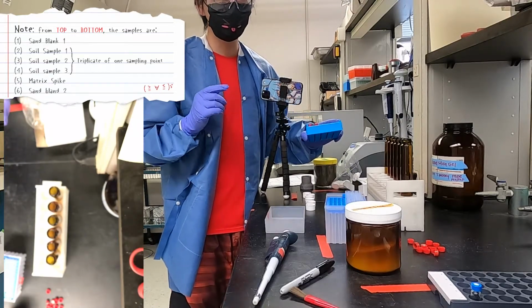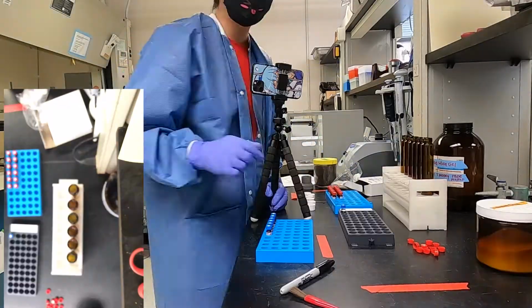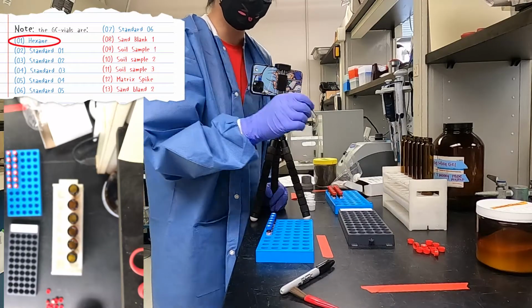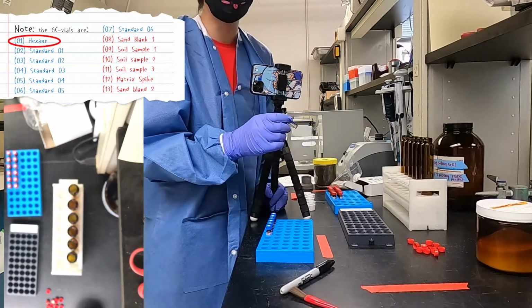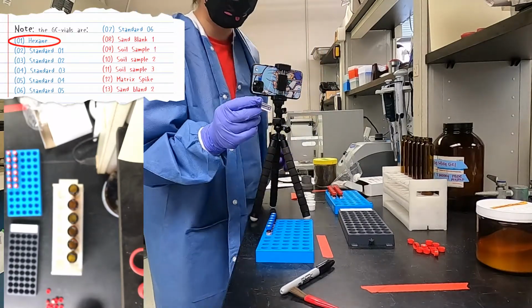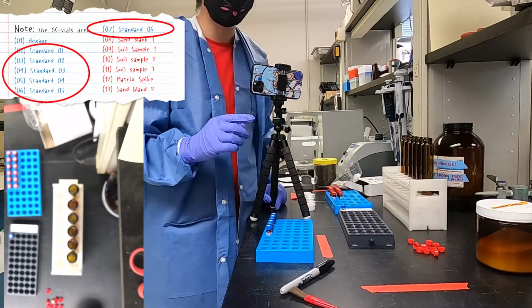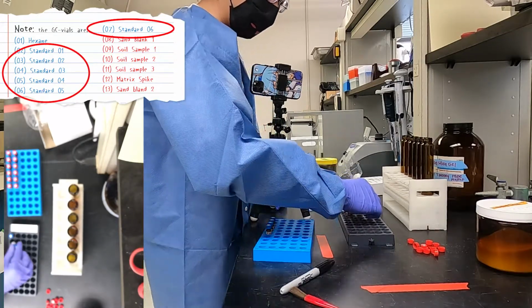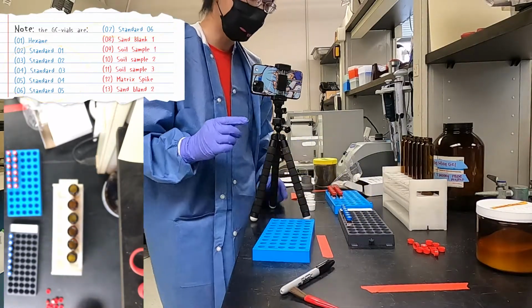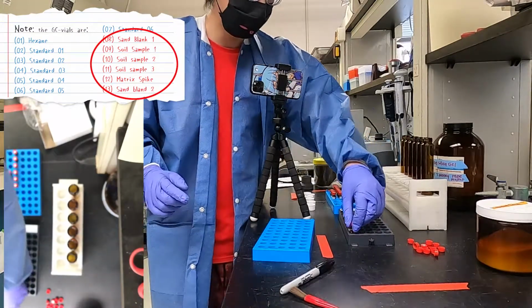But before we go to the GC for the analysis, we need to add more vials into the GC sequence. So for a typical GC sequence, first we have a pure solvent, and in this experiment we use hexane as a solvent. So this is pure hexane, and then it is followed by the standard curves because we want to calibrate the instrument first. And these are the standards for the calibration curve. And then we add 1 set of our samples into the GC sequence.